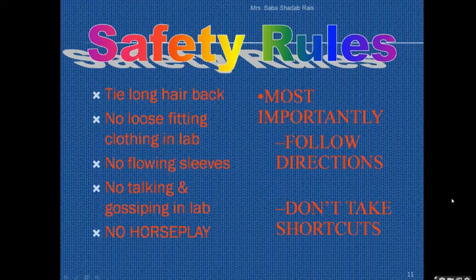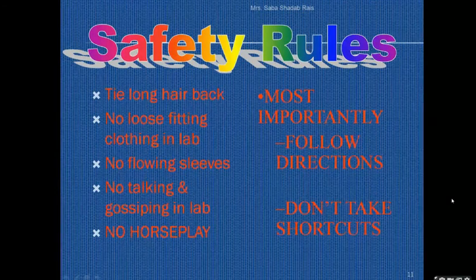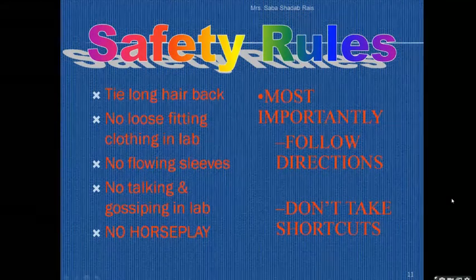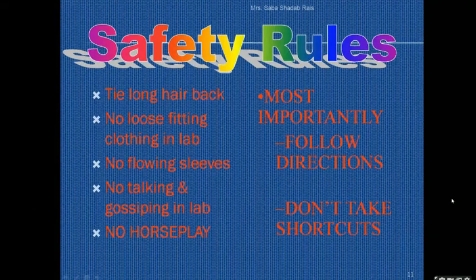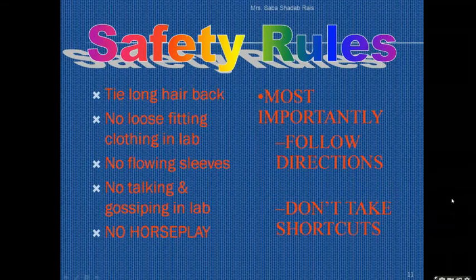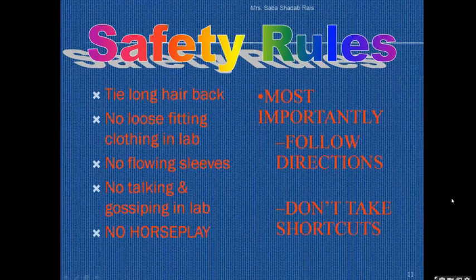Immediately, most of the students start writing into the journal, thinking they will copy it later. No, this is a wrong practice. You should maintain the record. You should avoid writing into the fair journal while performing the practical. Any chemical can fall on your fair journal, and you have marks on your fair journal. Not only this, the journal is the standard record of whatever practicals you are doing. So we should avoid doing it.